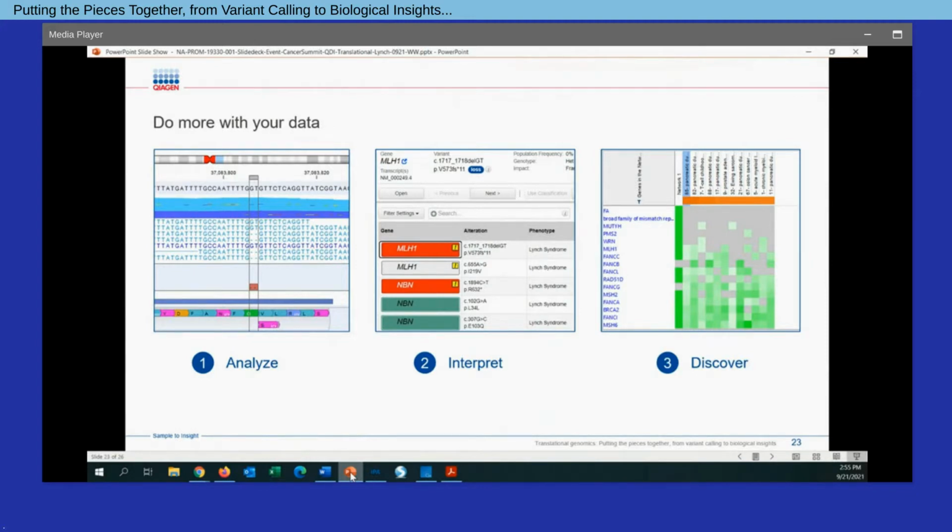From there, using Qiagen Clinical Insights Interpret Translational to prioritize those variants both within samples and across a cohort that are pathogenic and in this case represent a loss of function of a given gene set of interest. And then lastly, utilize Ingenuity Pathway Analysis for discovery, taking that gene set with a loss of function variants and determining what pathways are relevant. How does this loss of function signature relate to gene expression signatures in various public cancer studies?